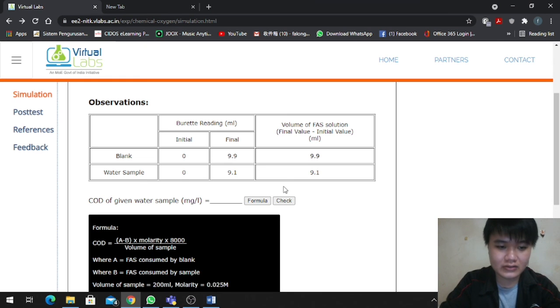So we need to do A 9.9 minus B 9.1 times molarity 0.025 times 8,000 divided by 200.